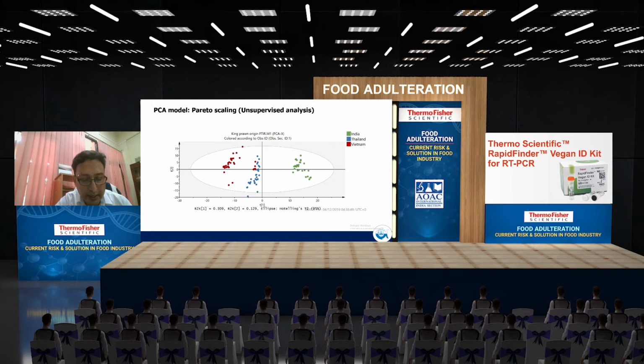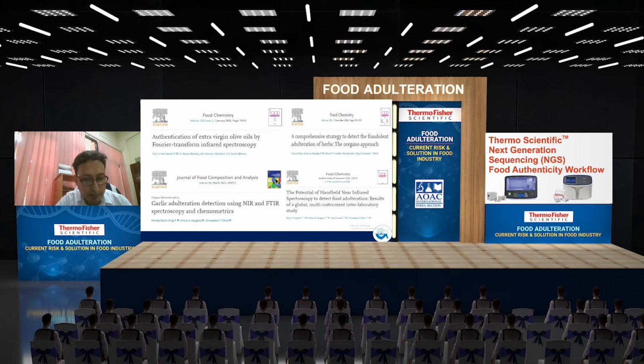So when we made a further model using that PCA plot, we developed an OPLS-DA model which could clearly discriminate between these three geographical origins.